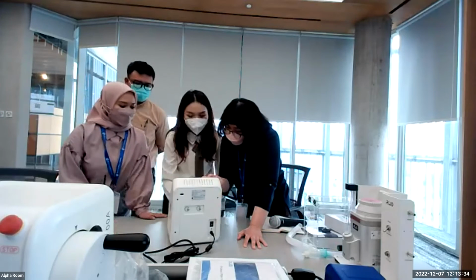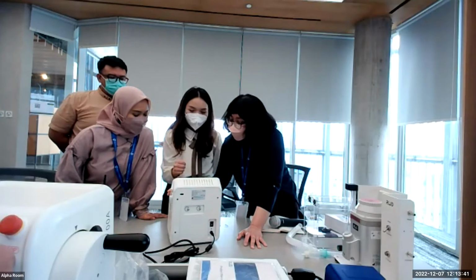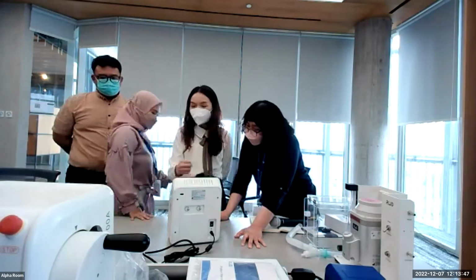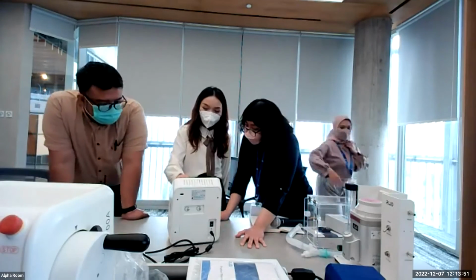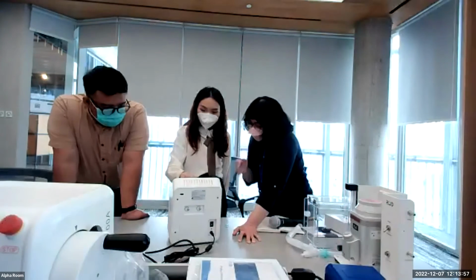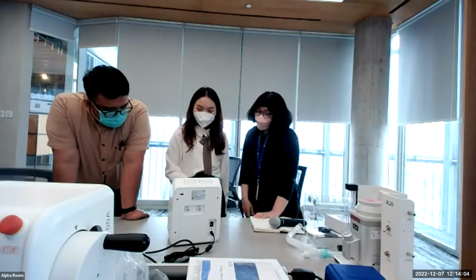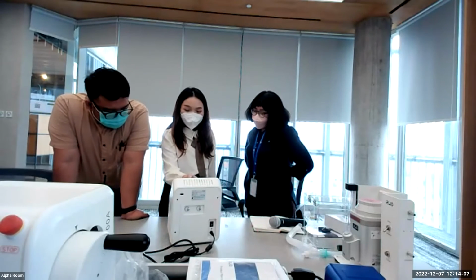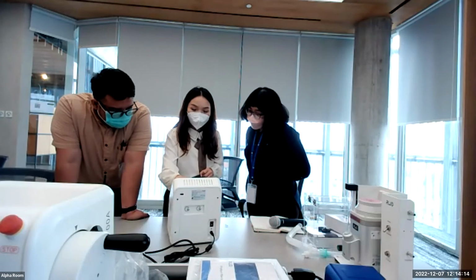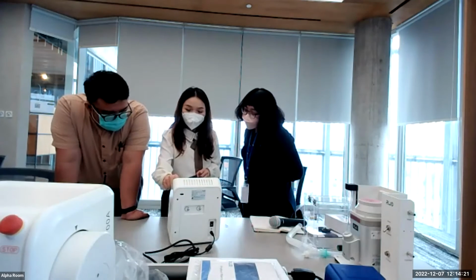When we use quick mode, we can adjust it quickly. If you don't choose that, you can also adjust it manually, but we recommend quick mode. For cells that are not very round, you could change parameters like the size, the brightness and the shape.